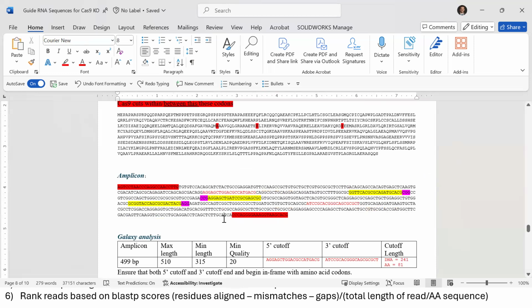We do this for several reasons. First of all, any sequencing technique is going to have a much lower quality next to the primers. So we want to make sure that those primers are far away from our target sites that we actually want to measure. Also, this specific product was designed to be used either for Nanopore or AmpliconEZ. So its maximum length there for AmpliconEZ is about 500 bases. Nanopore doesn't have that limitation, but these primers were designed with that flexibility in mind.